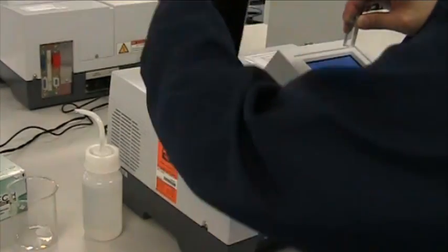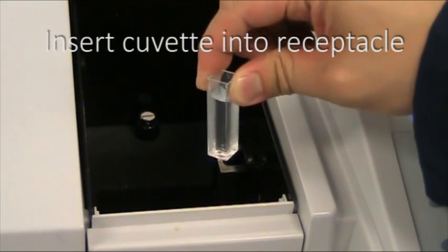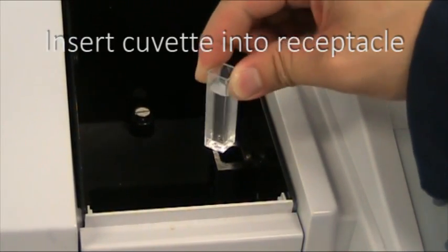Lift the lid and insert the cuvette. Note that the cuvette only has two clear sides. Insert the cuvette into the receptacle so that the clear sides face left and right.